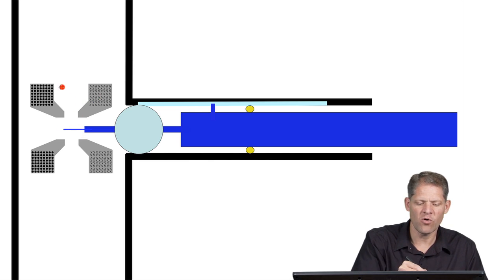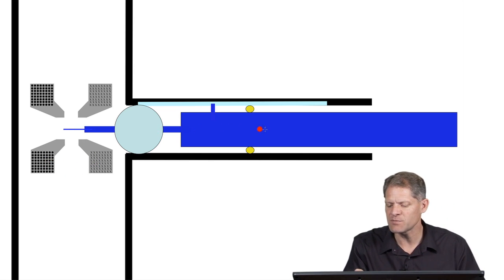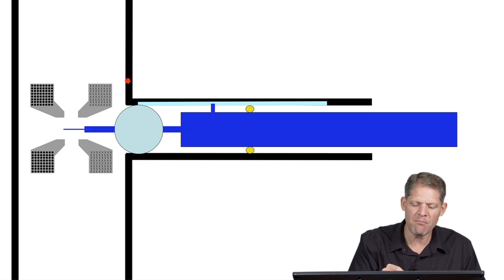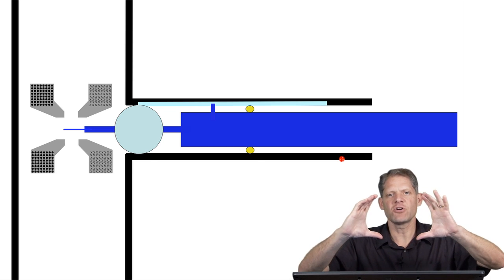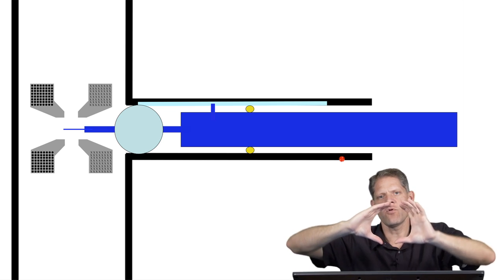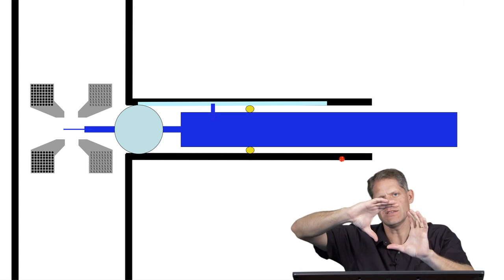Okay, so part of the coils of the objective lens are above the sample, and part of it are below the sample. And here's the specimen, and the specimen is held by the specimen holder. Now the specimen holder rests within a tube, and this tube is permanently mounted into the column of the microscope. And this tube has an outer sheath that's mounted into the microscope, and then inside there's the goniometer, which can rotate back and forth to tilt the sample. So imagine this tube that can rotate, and it's fixed in space.